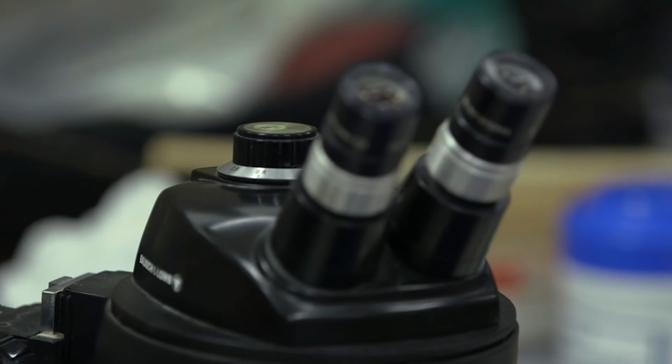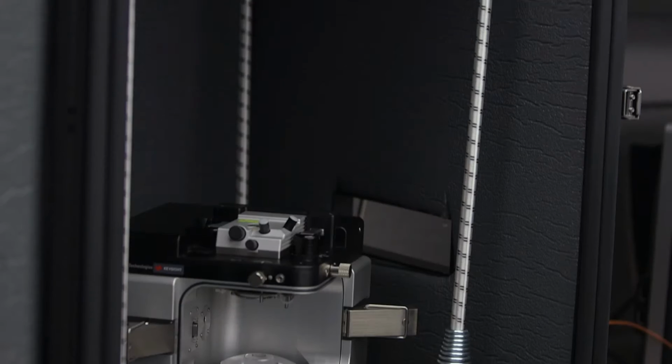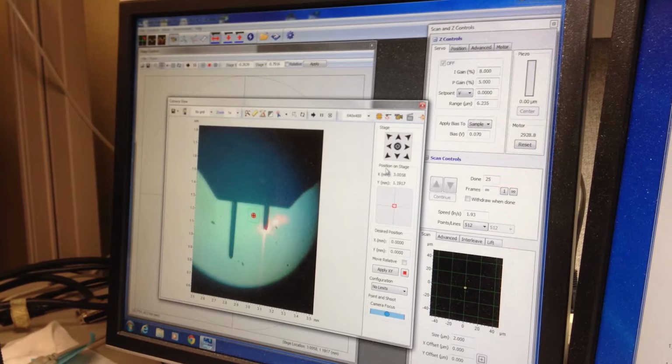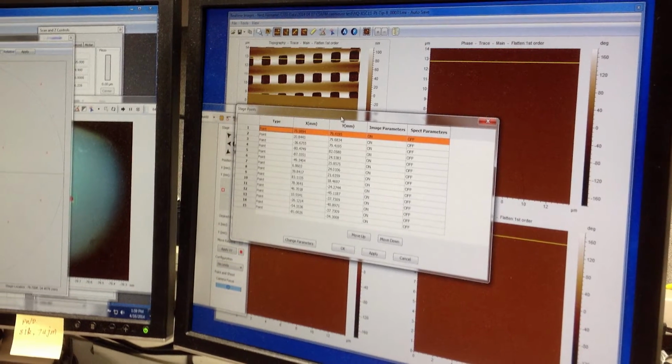Originally created for the scientific community, the application had a very steep learning curve that took years to master. Part of the problem was that the application presented all of the microscope's functionality all of the time to all of the users. In addition, the application was designed around the standard multi-window Microsoft desktop design language, meaning that completing a single task meant having a lot of open windows.